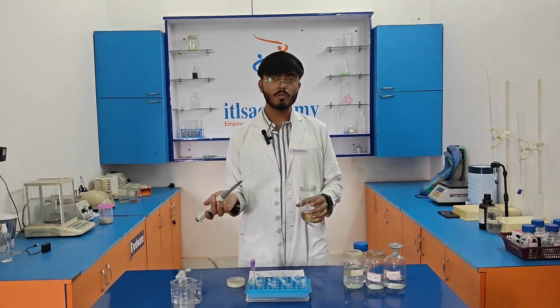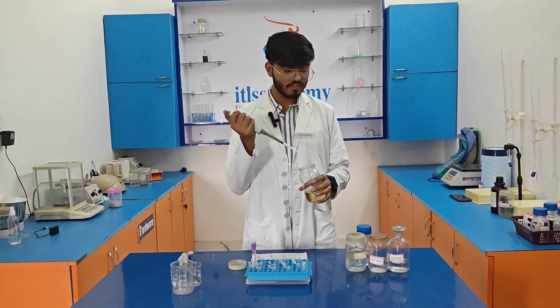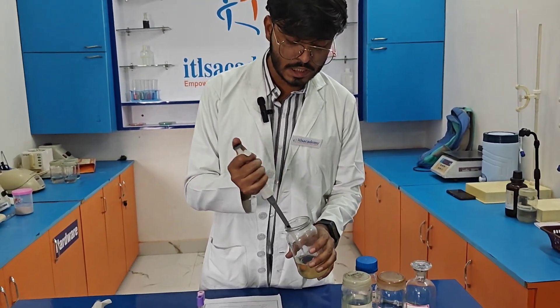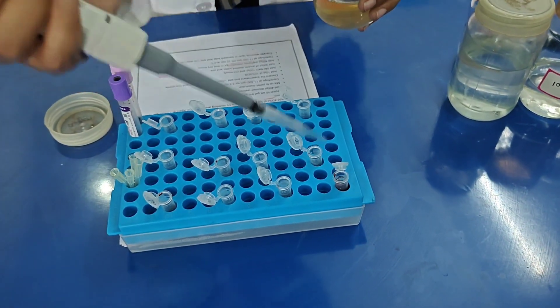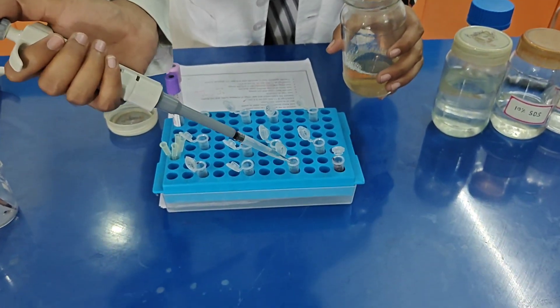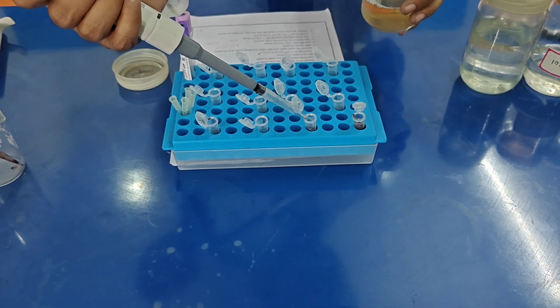After pouring the human blood sample into each eppendorf tube, I am adding 0.5 ml of lysis buffer to each tube and mixing them properly. After mixing, we need to centrifuge at 11,500 rpm for 5 minutes.